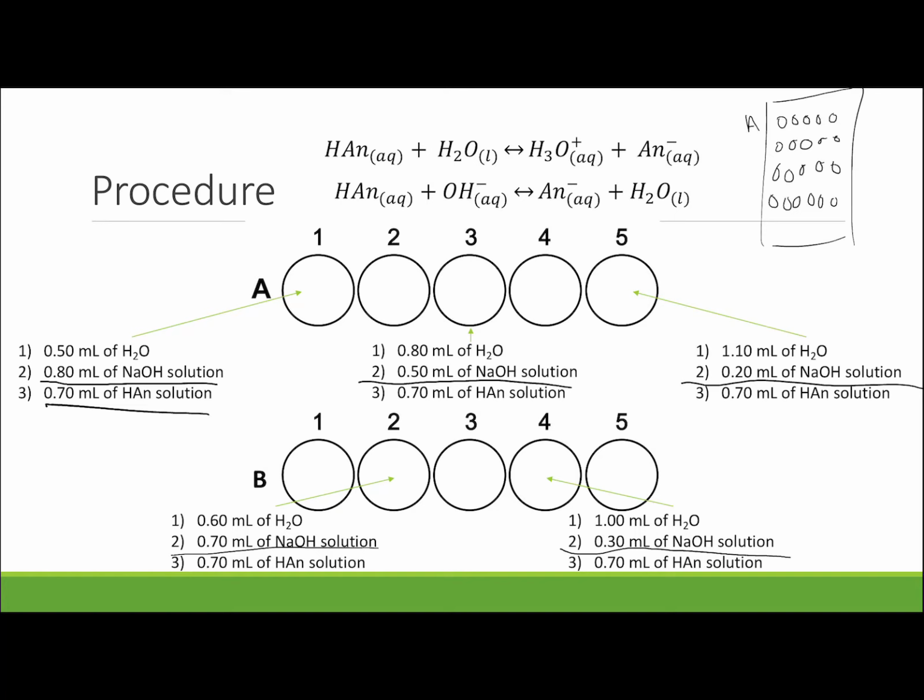He used rows A and B, and like I said, he staggered these to make sure he didn't get any leakage into other wells.